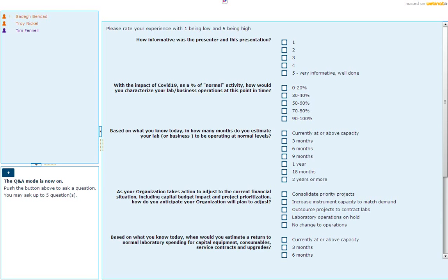So let's wrap up just with one question. Actually, there was a lot of TTS related questions, so I'll just pick one of them, and you can just comment on that, and then we'll close it up and answer the rest via email. So TTS, can I apply TTS over temperatures that transitions are happening? For example, below and after alpha or beta transitions.